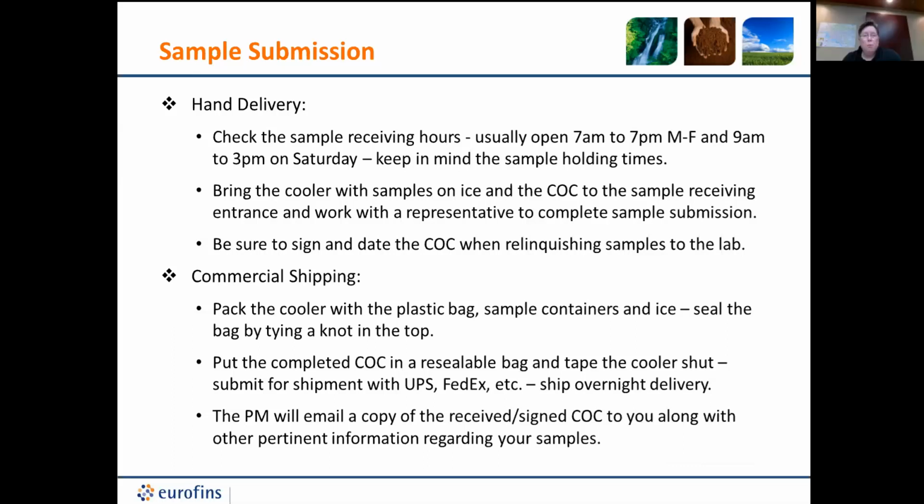So we prefer wet ice, and the difference is wet ice will actually chill something down. Think of it this way: if you're going on a picnic, you're not probably going to use blue ice to chill down warm soda. You're going to use wet ice. Blue ice is great at keeping things cold, but it doesn't have the cooling efficiency to cool something down. It'll warm up instead of cool something else down. We prefer wet ice.